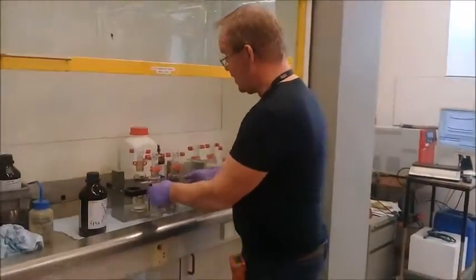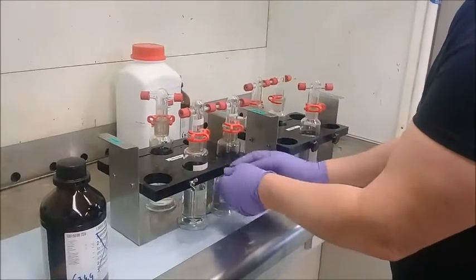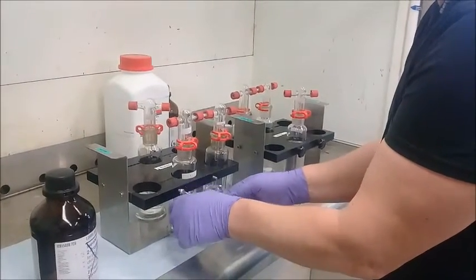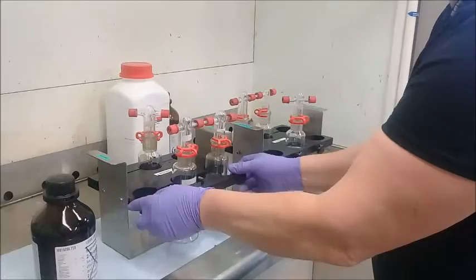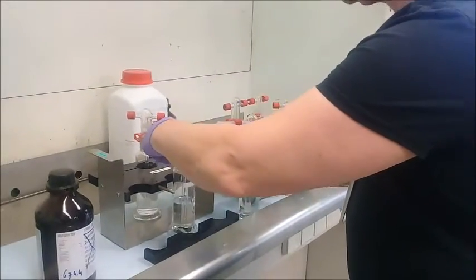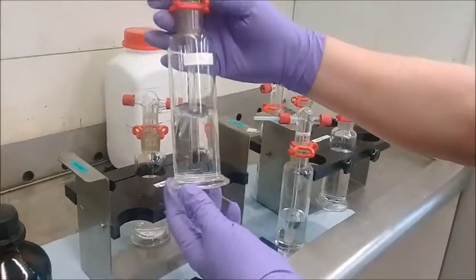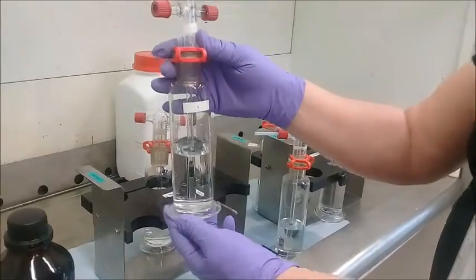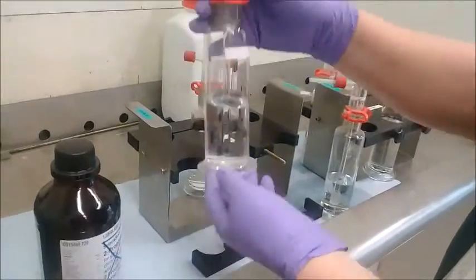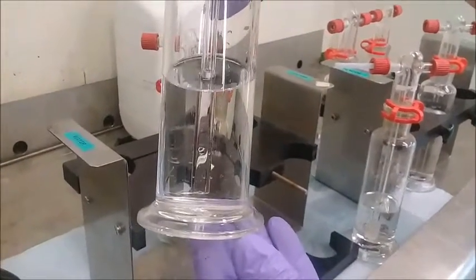So we have here the racks, and we can take it out. So they're all nicely tight, because you don't want to lose any of the glass in the bath. And we can take off. So these are the first bottles coming from the active carbon session, and you see it's also nice and colorless. Sometimes it has really dark colors like brown or black or yellow or orange, but now it's colorless like the isopropanol, with a slight color coming from the process, but that's not too obvious.